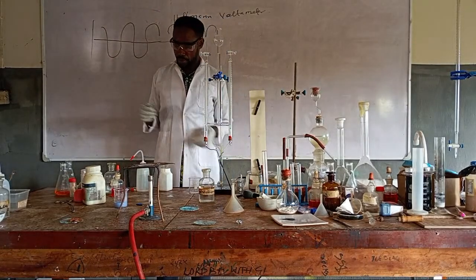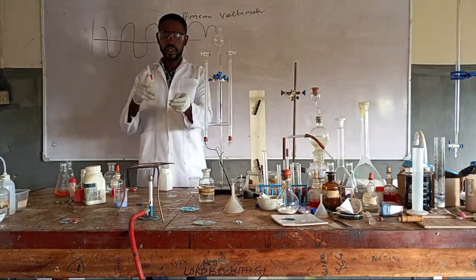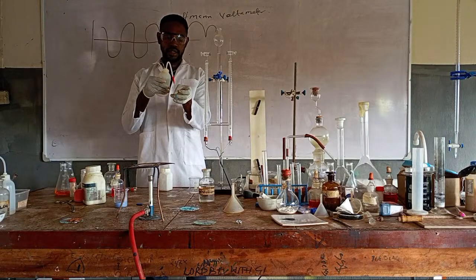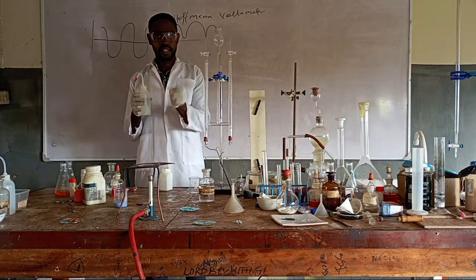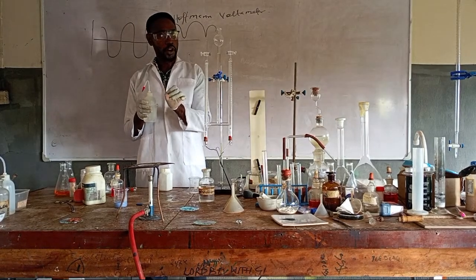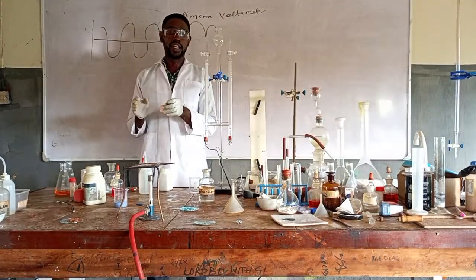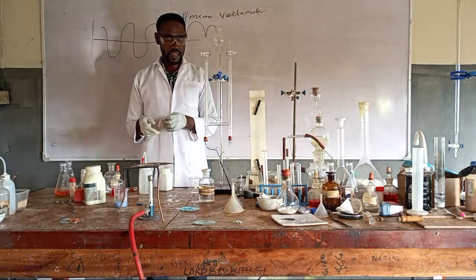This is water. Maybe we use our wash bottle. Okay, sorry. Let's try. Are you seeing? So it's not because it's acid. This is not litmus paper. This one will behave the same way in both acid and base because of the fact that there is what?